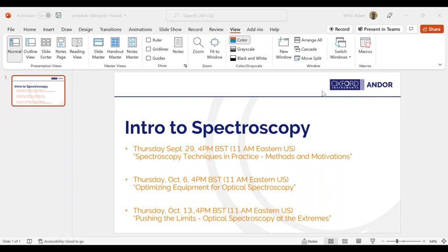diamond from graphite, just from how it transmits light. So absolutely, the question would be, what material system are you looking to tell the phases in between, or discriminating one phase from another? It could be done through Raman, looking at vibrational changes or changes in symmetry, probably less likely to do it via IR, but even something as simple as absorption.